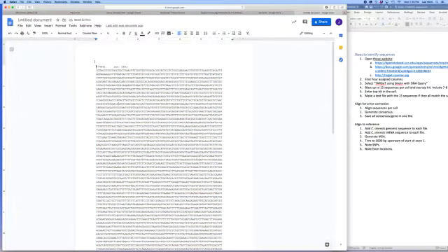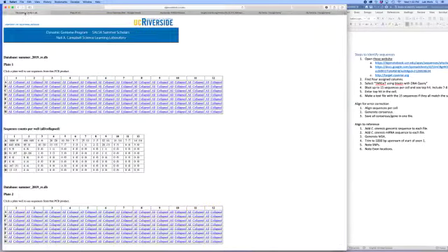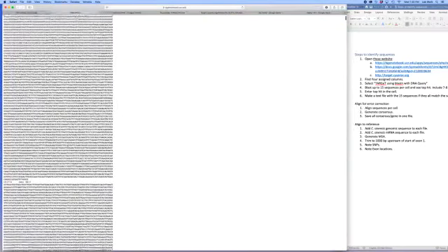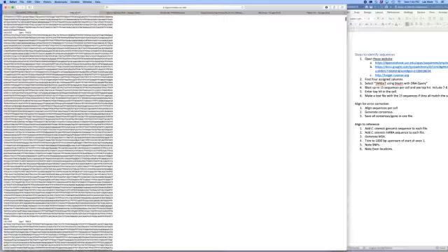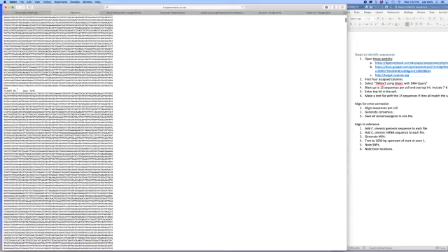Of course, we need to make sure we call this document plate 1A1. Okay, so that's hopefully going to become the name. There we go. So now we have that sequence, and then you want to go and do 15, and at least roughly half of those should be ones that are called RC. Let me find one here. There we go. So here's one that has the identifying number and then the letters RC.